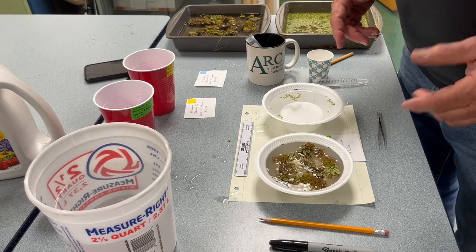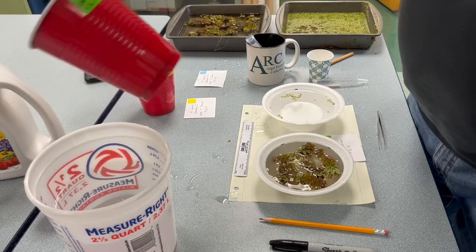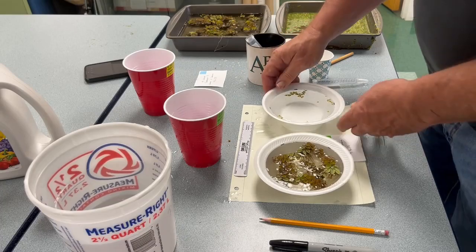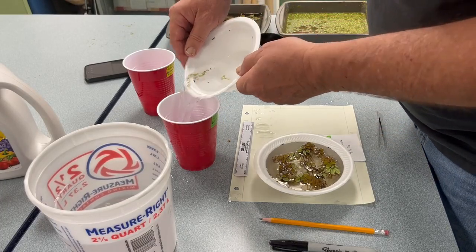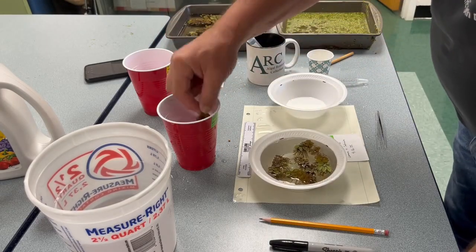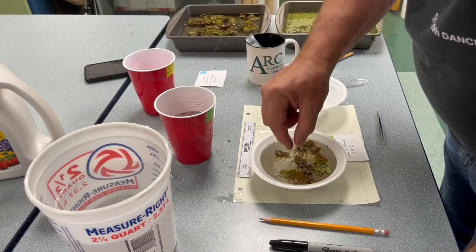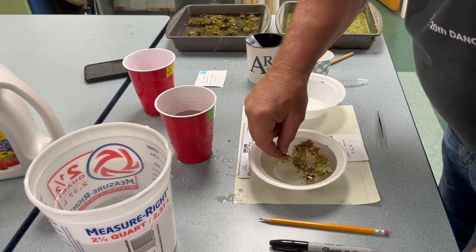Okay, once we've done that, we fill the cup that we're going to use, labeled treatment 1, Lemna small or low, Salvinia high, and we can see if this works. Just pouring this in here. Okay, that looks good. And then we'll pull these out by hand and make sure everything shakes so that they're not on top of each other, and so they're getting along nicely, at least at the beginning of the experiment.